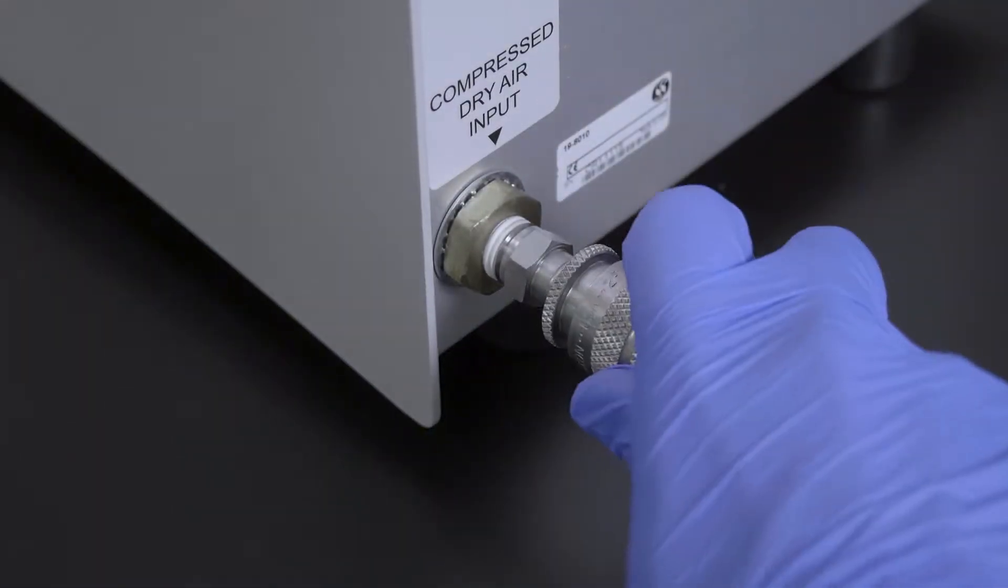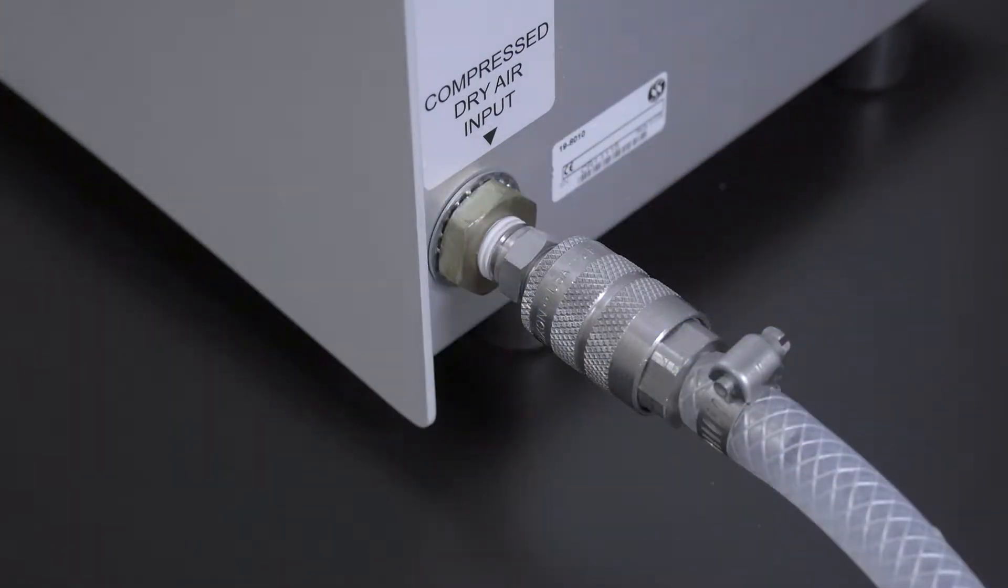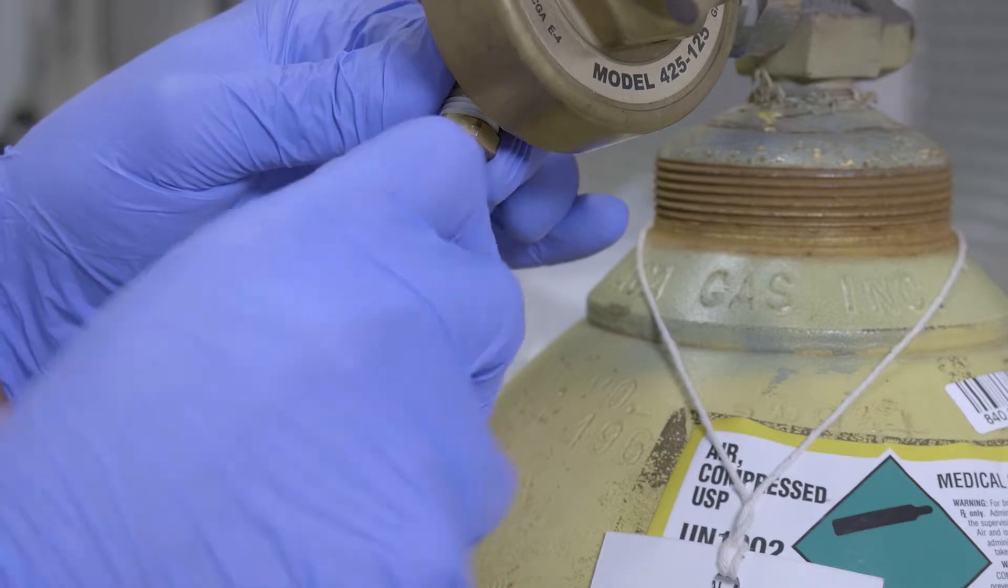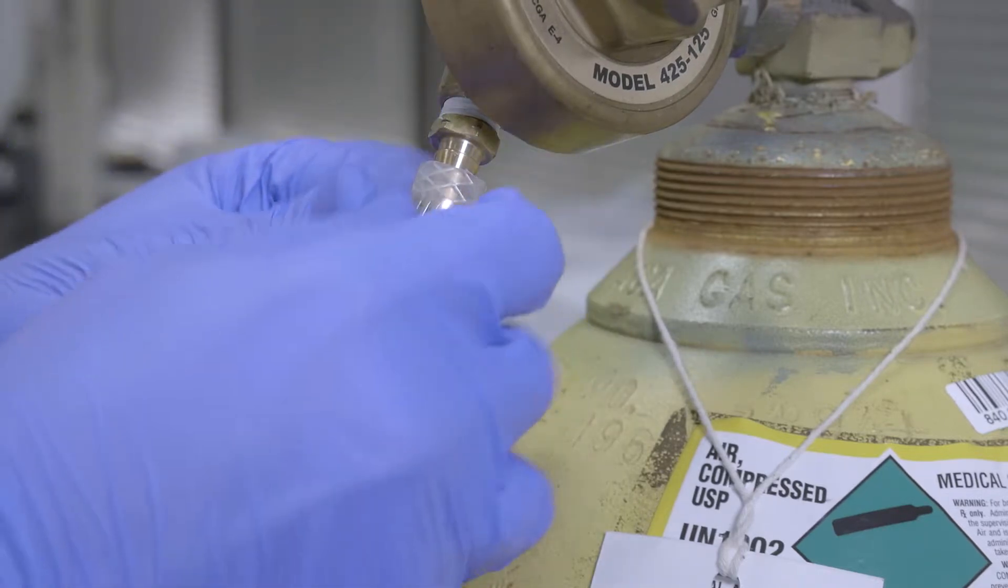Connect one end of the compressed air hose to the BeR Cryo unit. Connect the other end of the hose to your air supply. An additional fitting may be required.